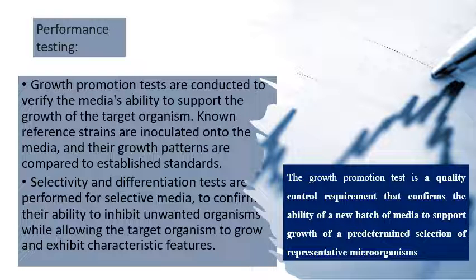Growth promotion testing is a quality control requirement that confirms the ability of a new batch of media to support growth of a predetermined selection of representative microorganisms in every setting.